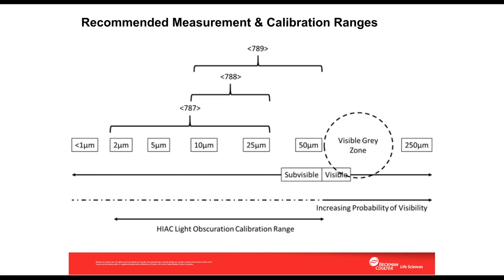And just adding measurements at greater than or equal to 2 microns and greater than or equal to 5 microns are also very useful. And it points out that the measurements at 2 microns are really a great indication of the quantity of protein aggregates in a biologic.